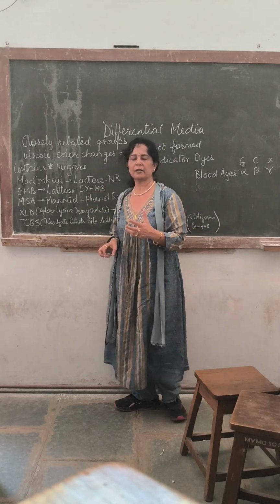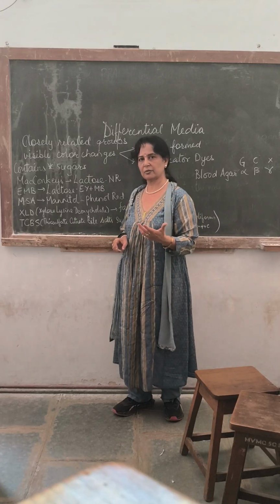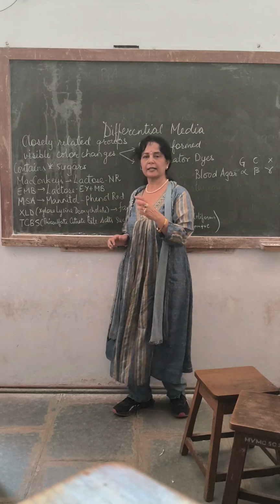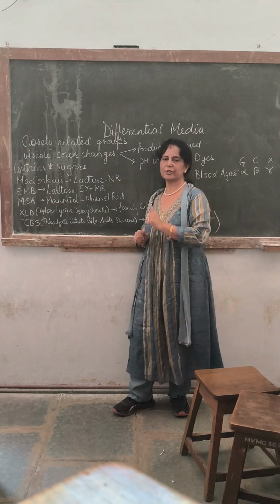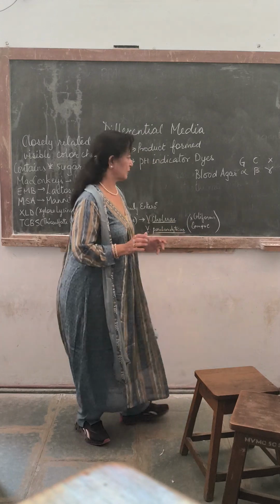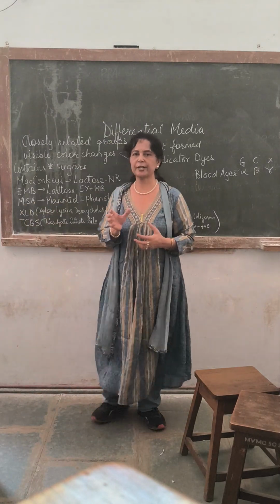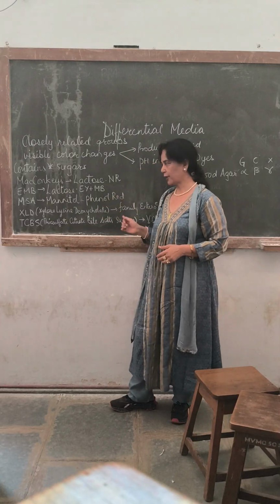If there is production of acid in a larger amount by lactose utilization, there will be a dark centered colony which will give a green metallic sheen. That will be Escherichia coli, and if the colony only has a purple color and is mucoid and bigger in size, it is considered Enterobacter aerogenes.